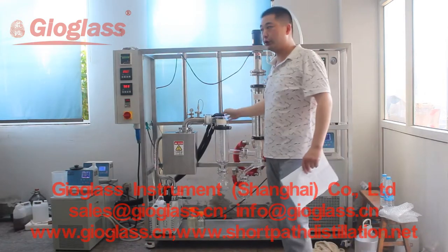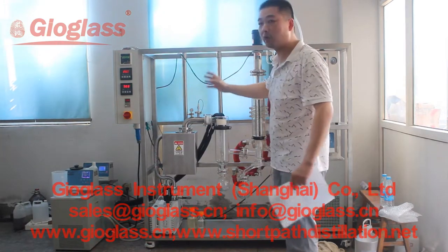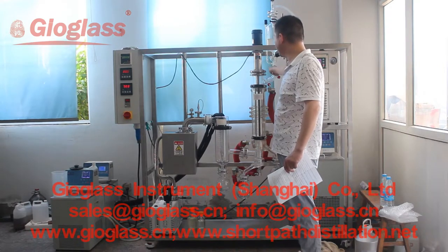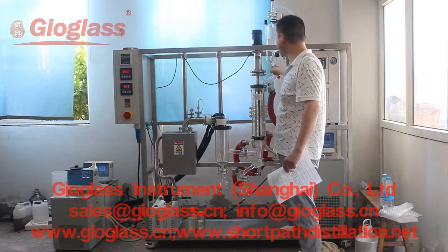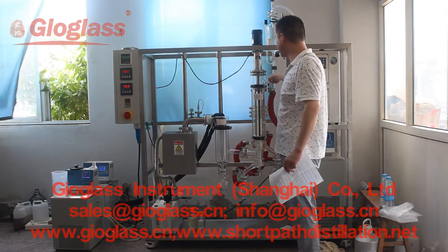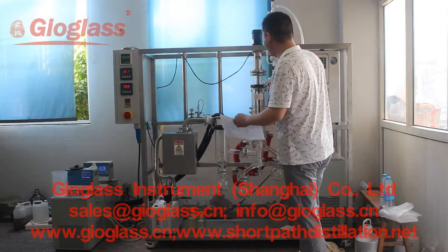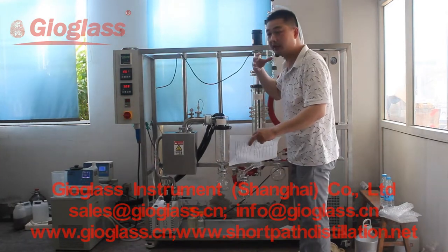This is our whole jacket SPG. You can see the feeding pipeline is jacketed, and the receiving pipeline is also jacketed, to keep warm during the whole distillation process.